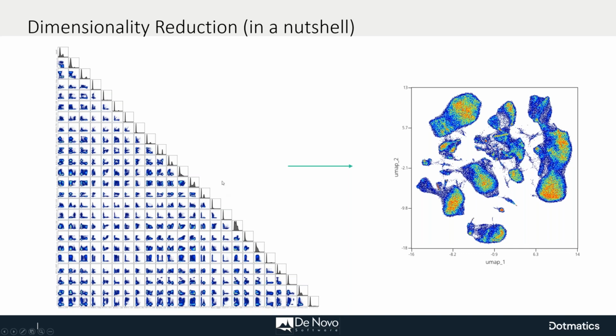But regardless, in dimensionality reduction, the goal is to look at the differences in many, many dimensions and distill those differences down into just 2 dimensions, to make it easier to see all the different phenotypes you have, what's in your tube. Then you can either gate on this or do clustering and display it on this, and we'll see that in a little bit. The goal is to help you look at the different phenotypes, or the different functional subsets if you use functional markers in your dimensionality reduction. And also you can use TSNE or UMAP to QA or QC your data.